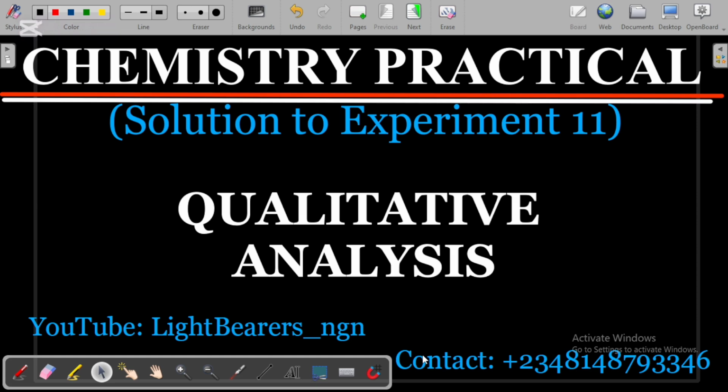All right, welcome to today's class. In today's class, we are going to be dealing with experiment 11 of chemistry practical, and that is qualitative analysis.